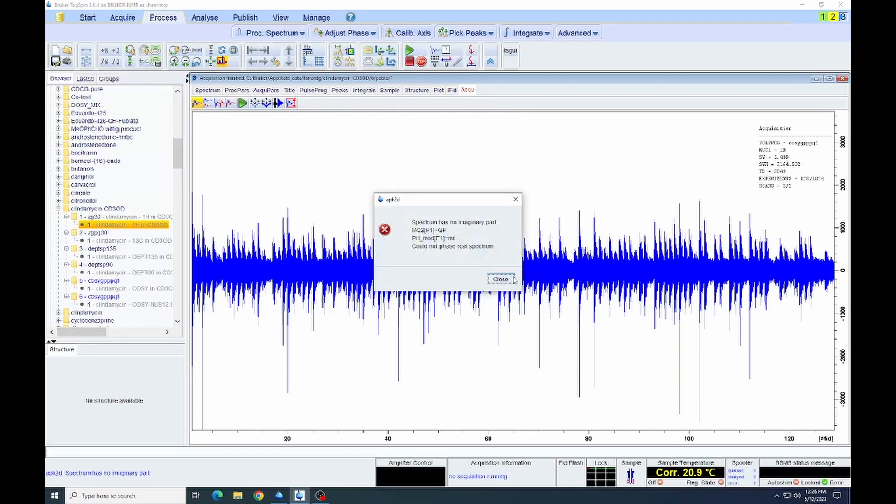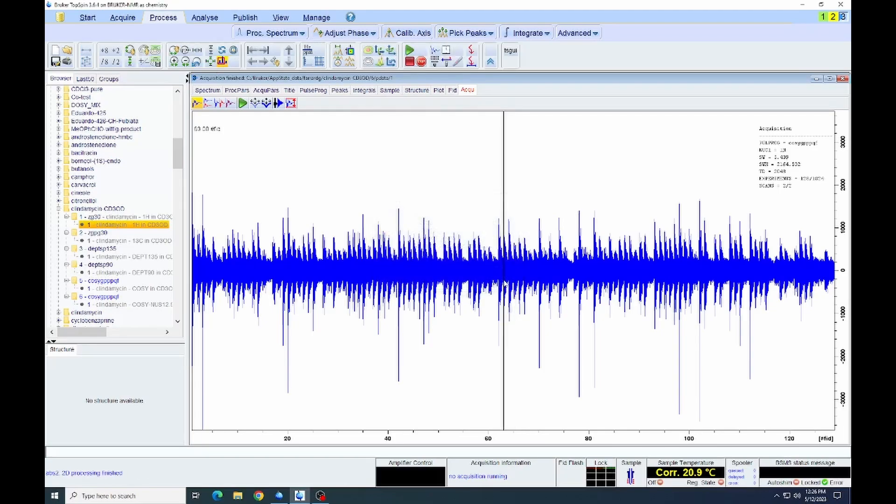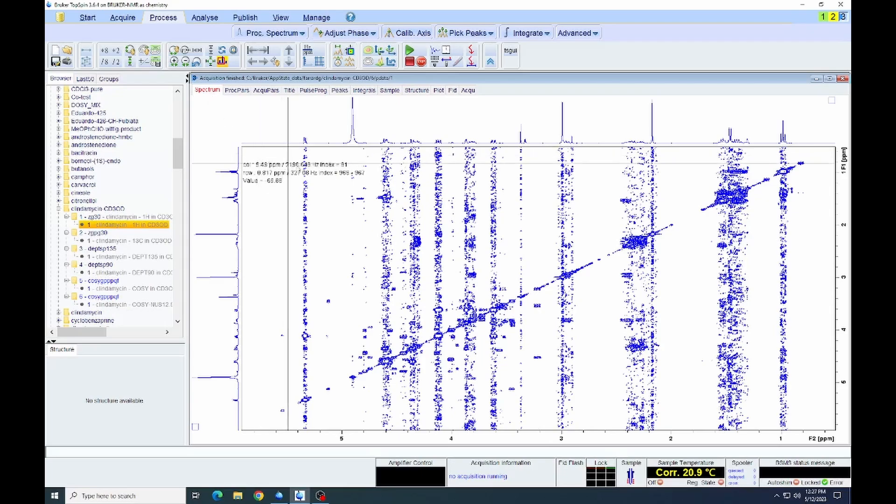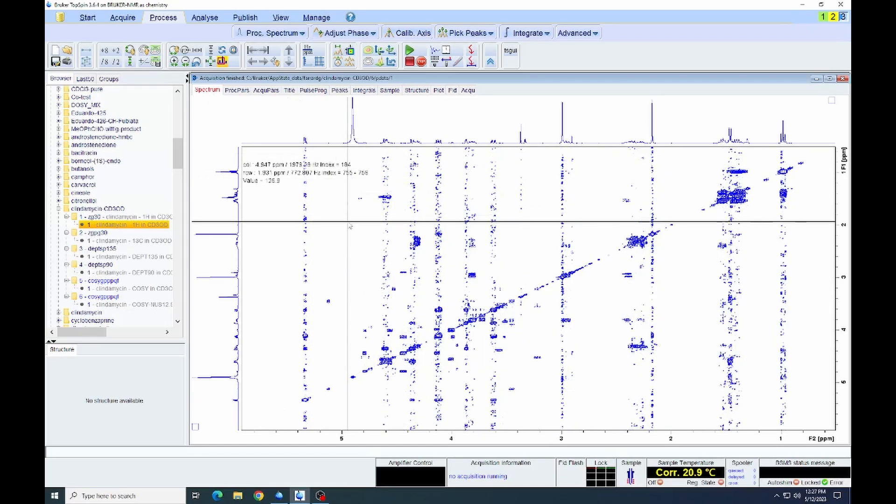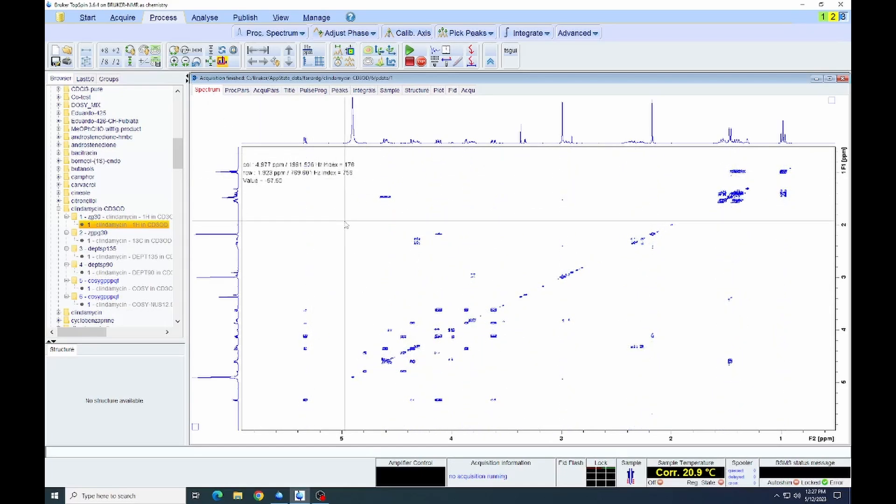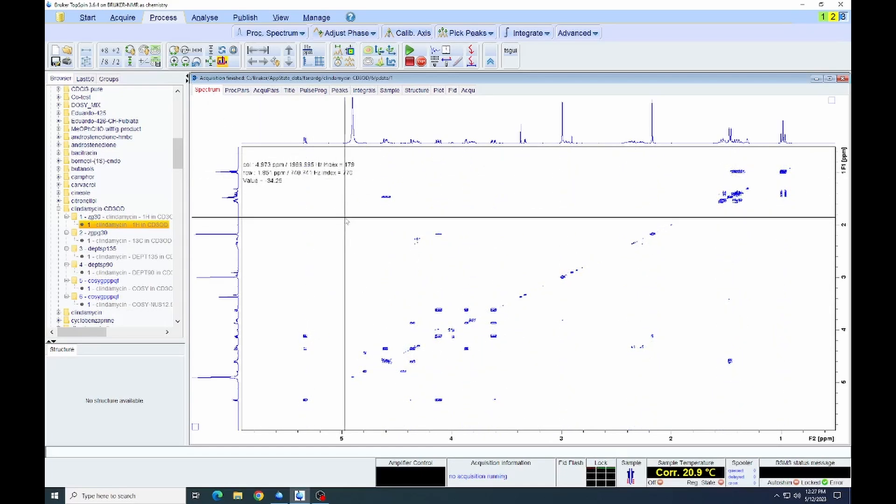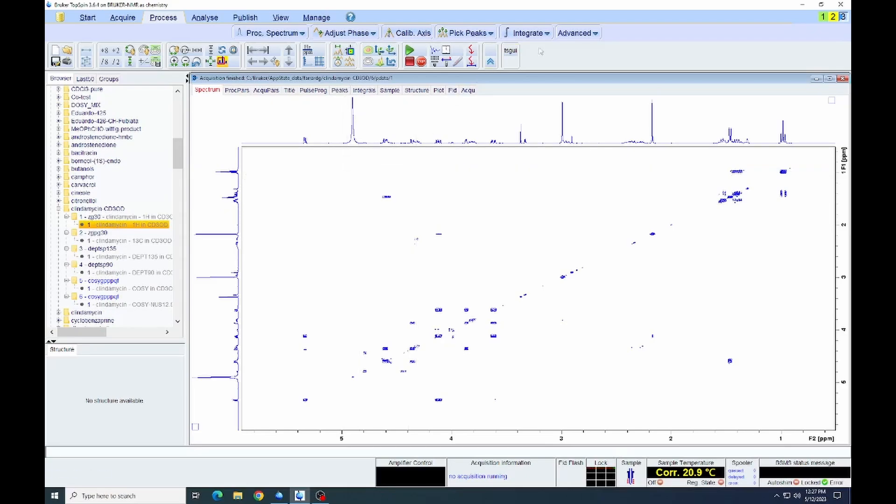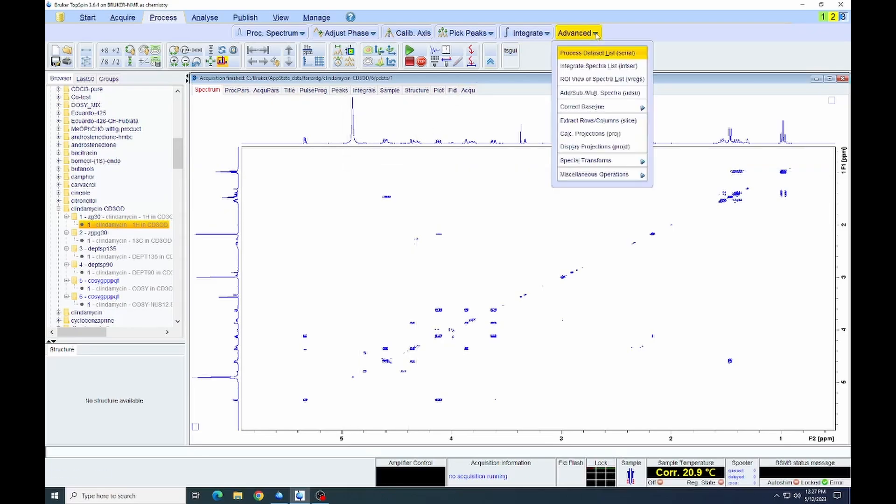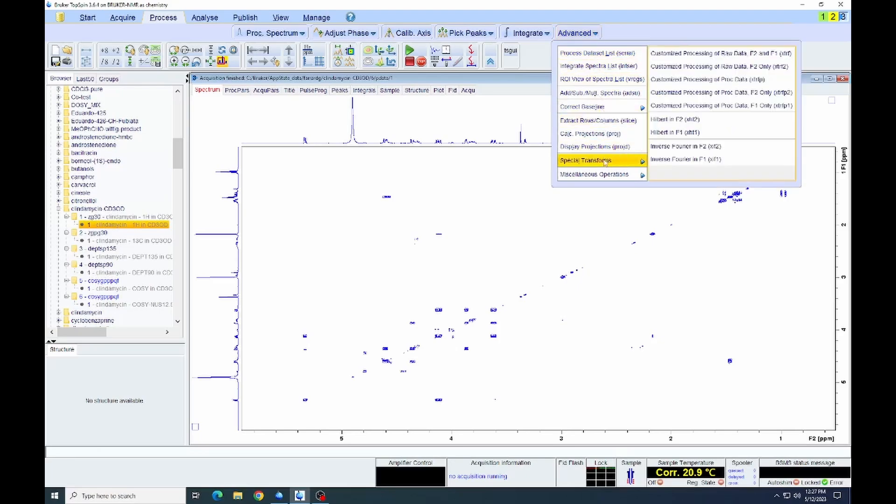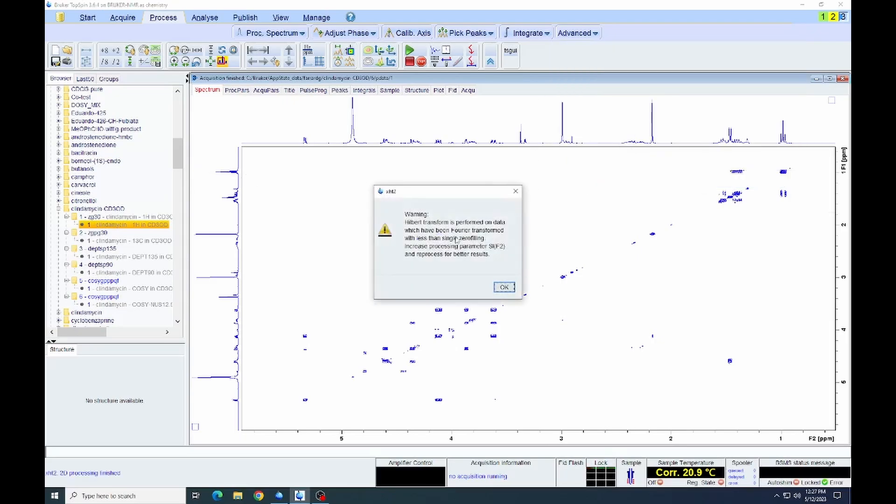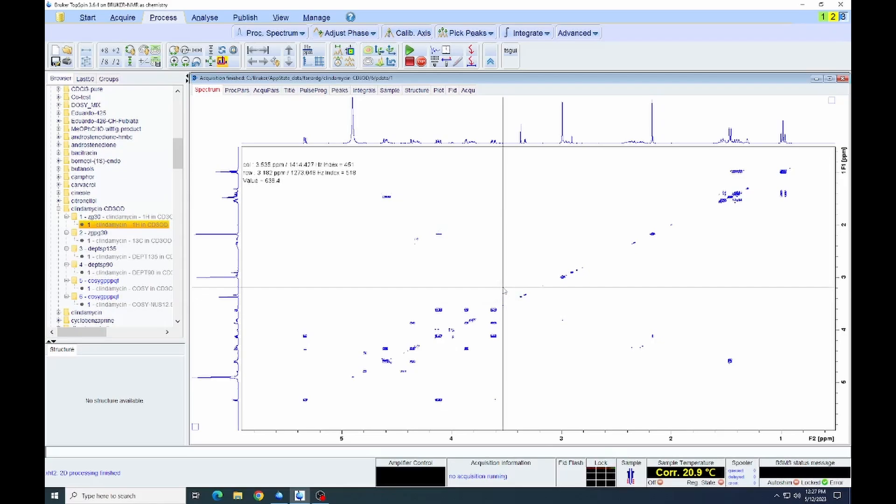So now that it's done, we can close. Click the spectrum window to view the spectrum that we have. Again, adjust the threshold or the peak size. We can see the spectrum that we have. We are going to go to advanced here and do special transforms to select Hilbert in F2. You can also type XHT2 in the command line to accomplish the same thing. And then we can reprocess the spectrum.